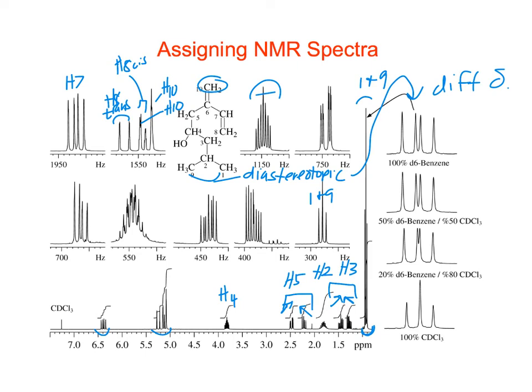Is it exchanging with the hydrogen? Well, is that carbon going to exchange? Probably not. No, never. I'm not sure. Is there any proton in this whole molecule that we haven't assigned yet? Oh, the oxygen. Oh, the OH. Yep. So I think the OH is also hidden under there. We can't really see it, and it can move around, right? So it's probably just a broad peak underneath here.